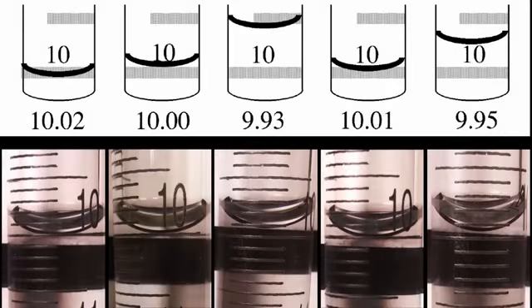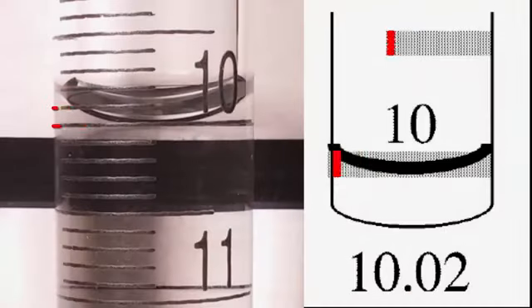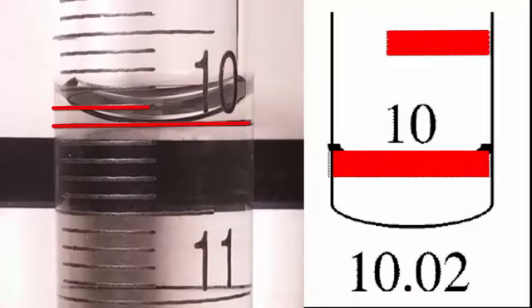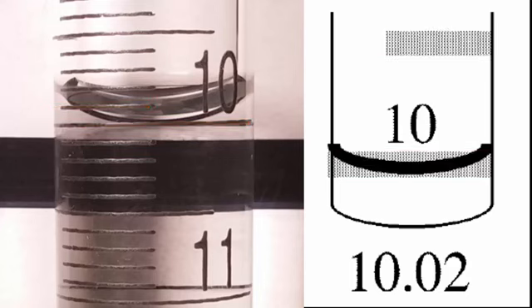Reading a burette to the second decimal place. To accurately read a burette to two decimal places it is important to be able to estimate the meniscus position between two burette markings. Here are five examples that we will go through to demonstrate how accurate readings are taken. To take accurate readings it is important to know that the thickness of each marking is approximately 0.02 milliliters. You should always use the top of the markings as the stated value.